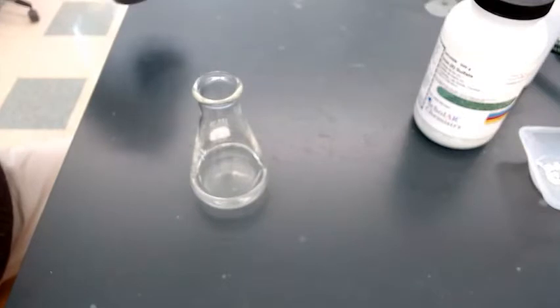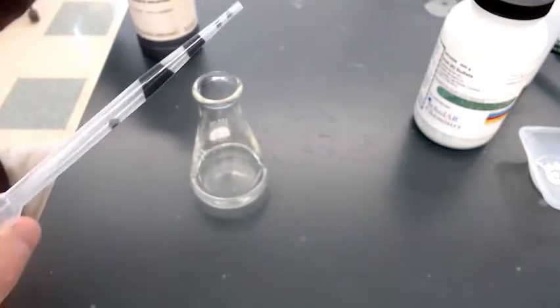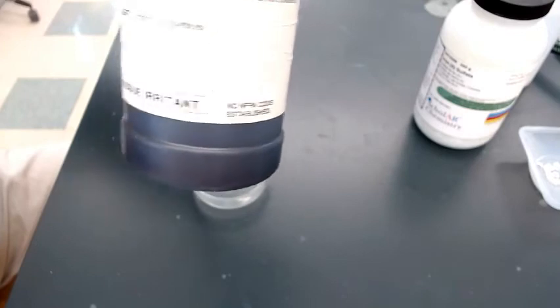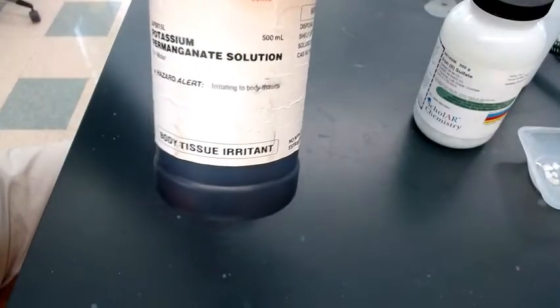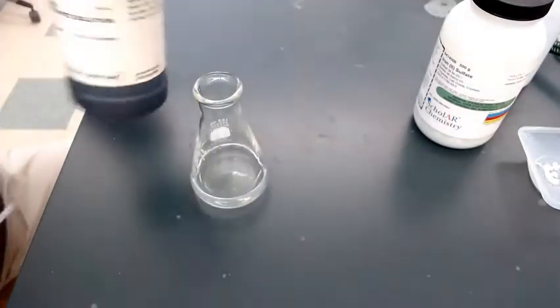What I'm going to do now, and this is what I would put into my titration, but I'm not going to do it, I'm just going to use a pipette here. I'm going to take some potassium permanganate solution. Permanganate is MnO4, right? Potassium is a K plus. So potassium permanganate, and this is a 0.1 molar.